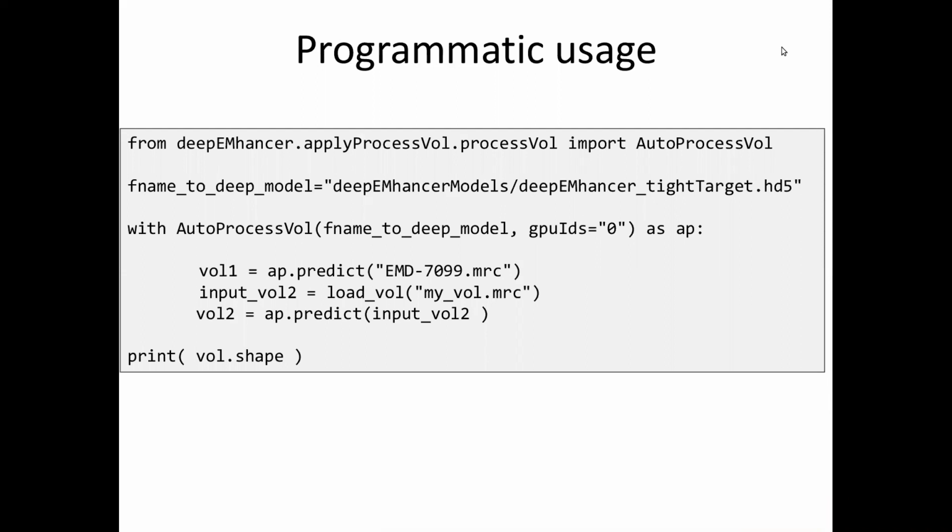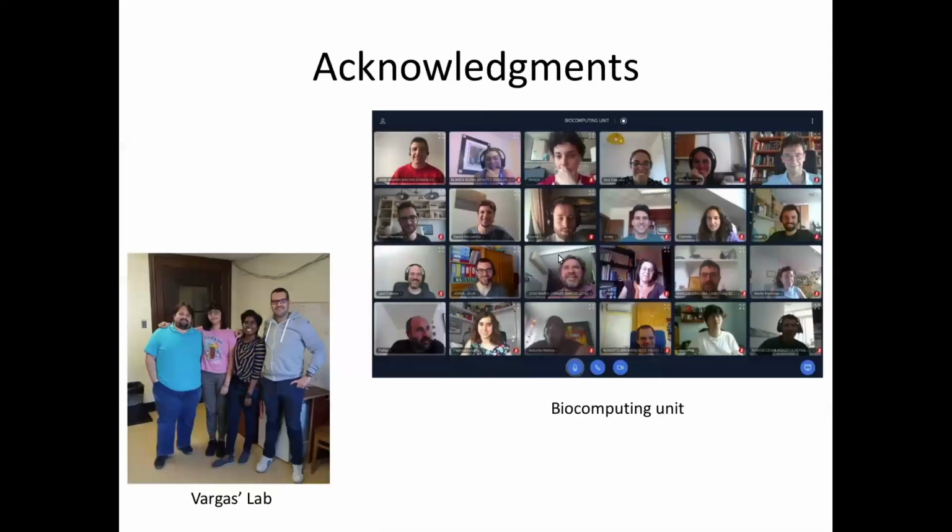And finally, since this is a Python package, you can programmatically make use of it. You can just import this class, which is responsible for the post-processing. And in a few lines of code, you could be performing the same post-processing as in the command line, very simple. And it will take care of the normalization and all the details. So if you want to integrate this tool in others, this should be fairly easy.